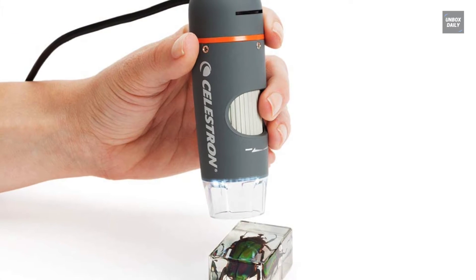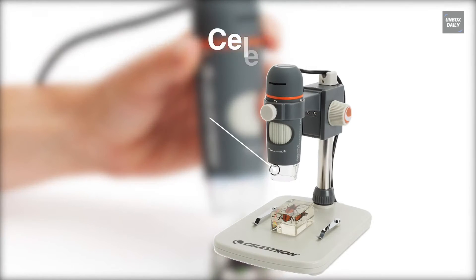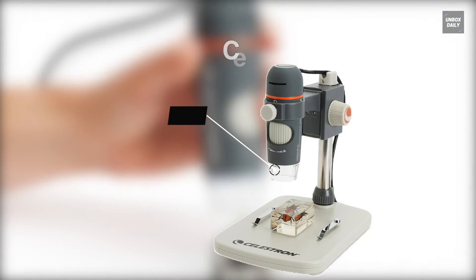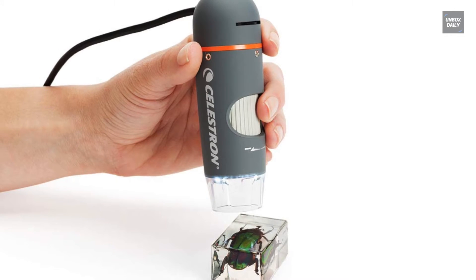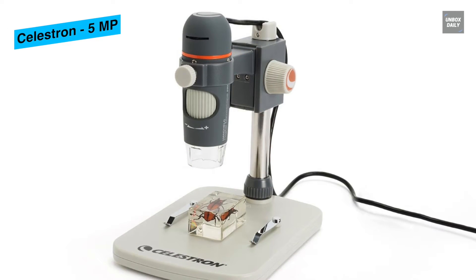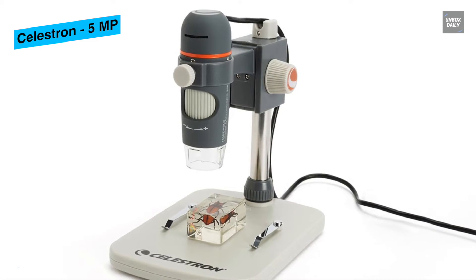The Celestron Handheld Digital Microscope Pro is an ideal magnifying lens for specialists, center school, and secondary school studies. It is an inventive and simple-to-use handheld digital magnifying instrument that will give the best viewing experience of 3D specimens.